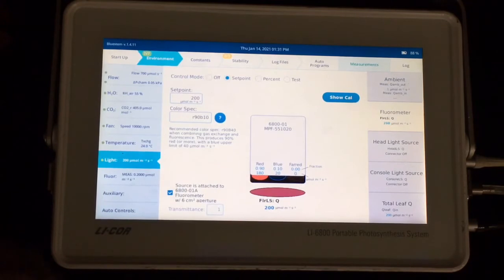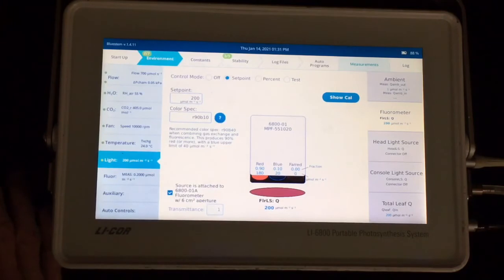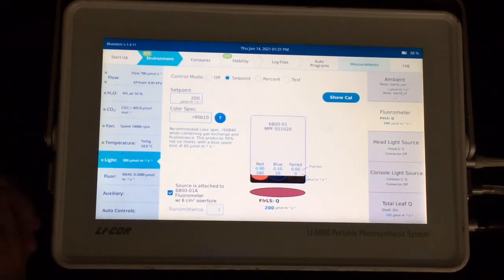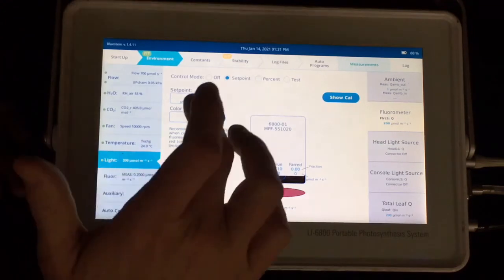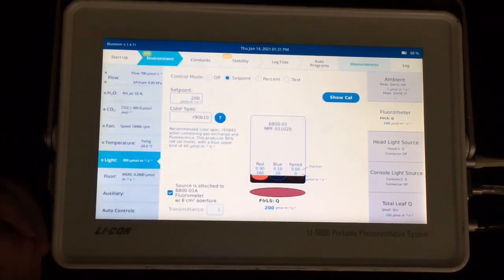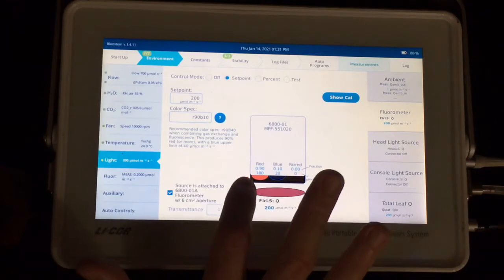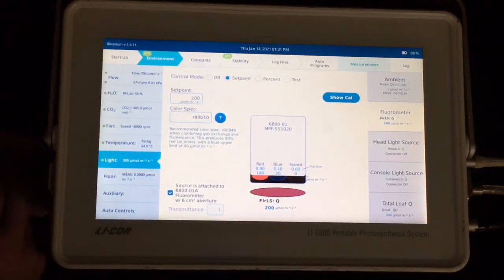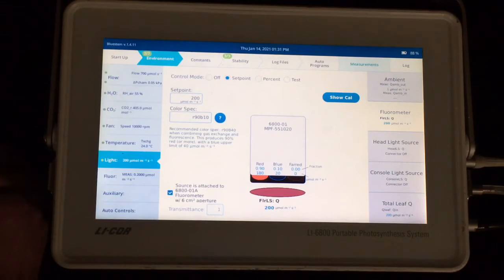The light environment, as I mentioned, I have the fluorometer on my chamber. And I'm going to pick a set point that's probably very close to what I measured prior to clamping on these leaves. Or measure kind of the average light environment of my cohort of leaves I wish to measure. And that's what I'll choose for my set point. You also can choose the red-blue mix. A most common approach is to use mostly red light with a little bit of blue, about 10%, to help keep the stomates open. For a survey measurement, that's probably not a requirement, but that is a sort of a typical setting.